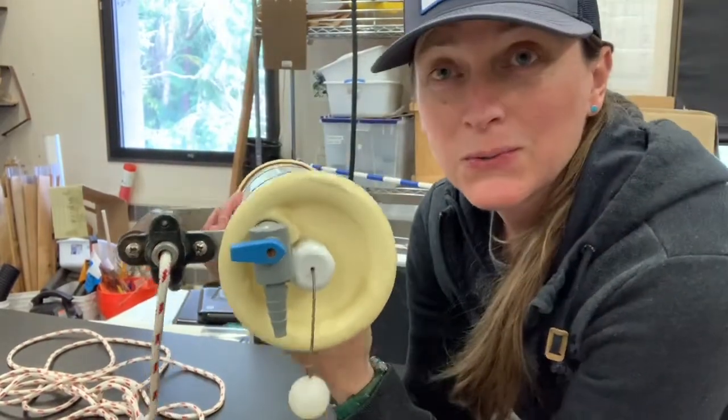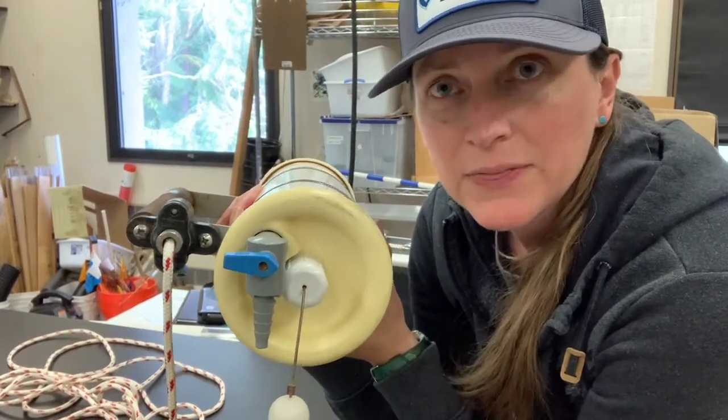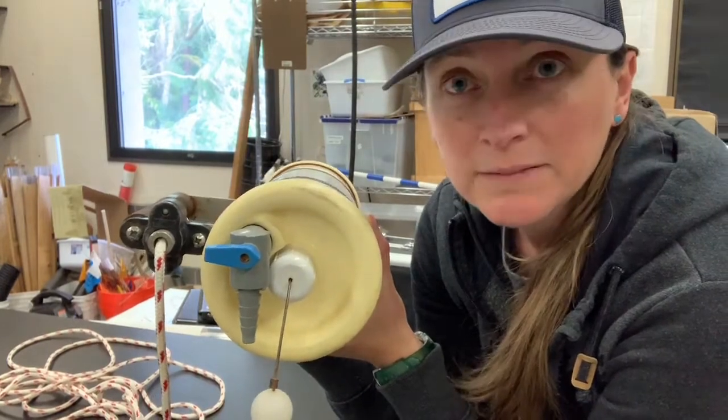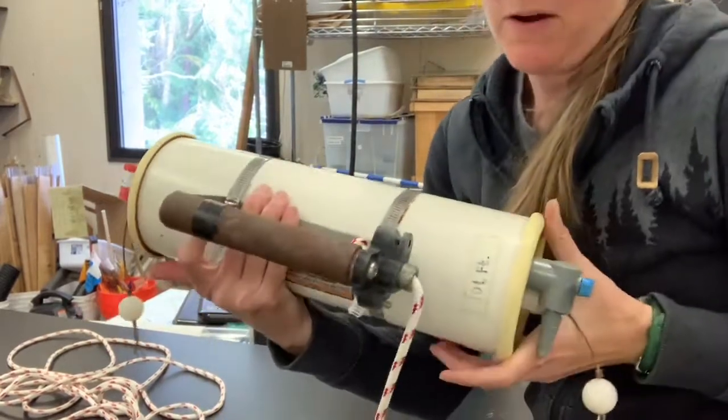That's really cool because it allows us to catch water at different layers in the lake — to find things like the chemocline, or to find bacteria that might be living along the thermocline in the lake. So that's a Van Dorn bottle.